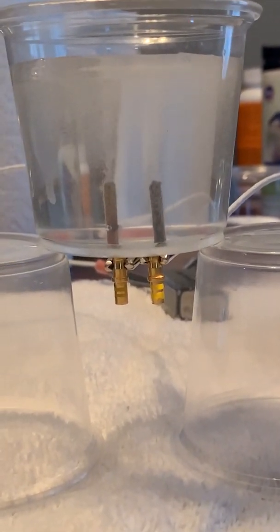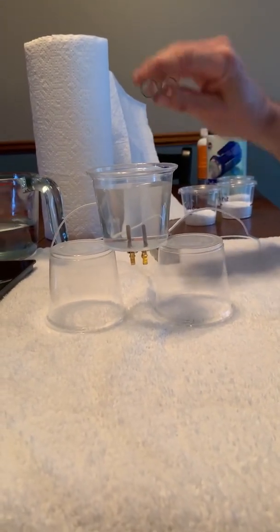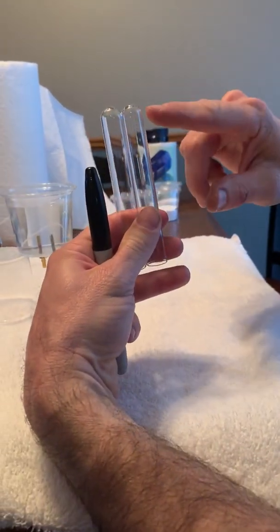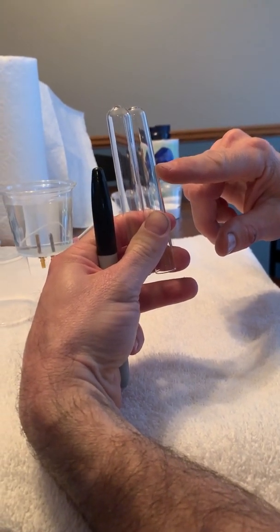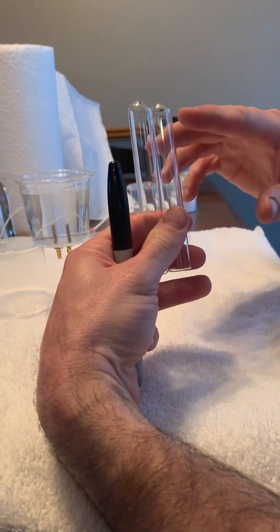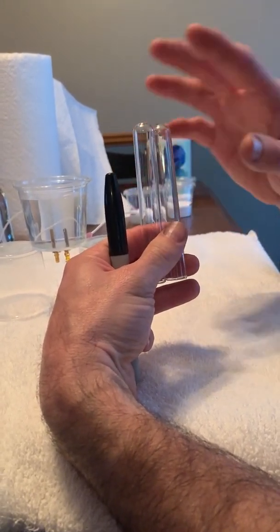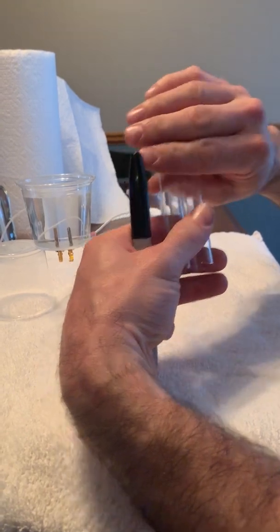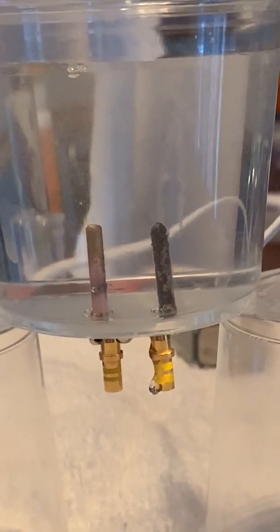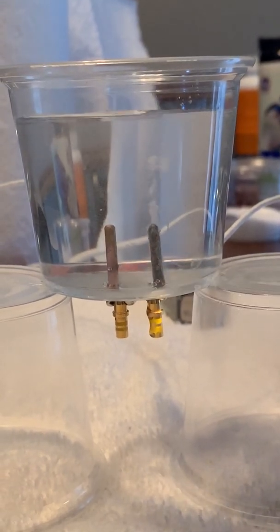Now, if I were able to dip the test tubes in the solution, which I'm not because this is drain cleaner, and put these over top of the electrodes, you would notice that the water would be pushed down twice as far on the cathode side than it would on the oxygen side. Supposedly this is how they found out there were 2 atoms of hydrogen in water and 1 oxygen, because there's twice as much gas that it produces. So you can see on the right side, that is the hydrogen, and the left side was the oxygen gas.